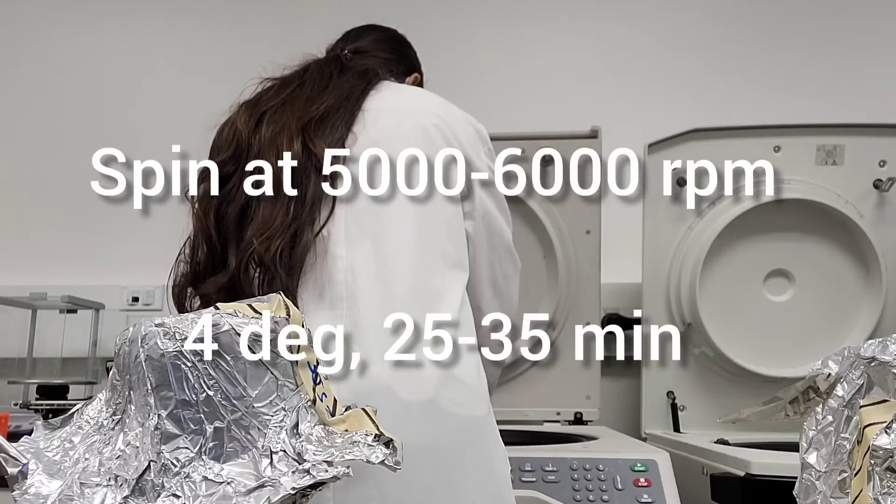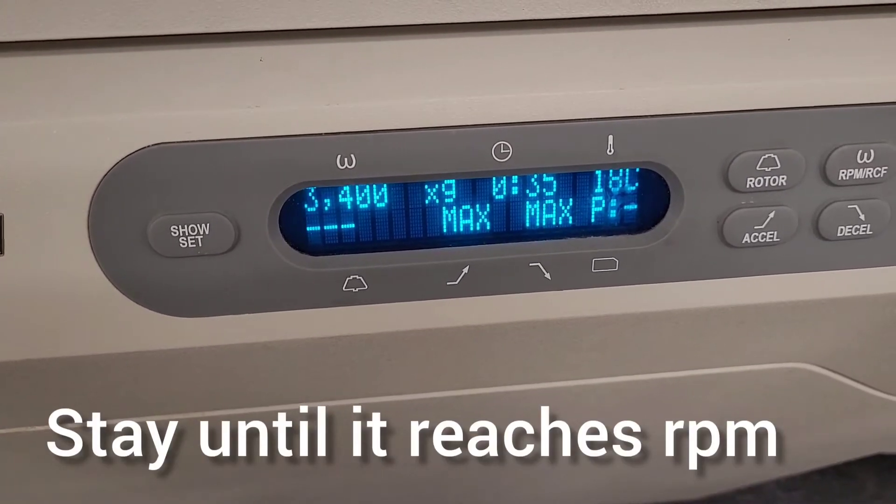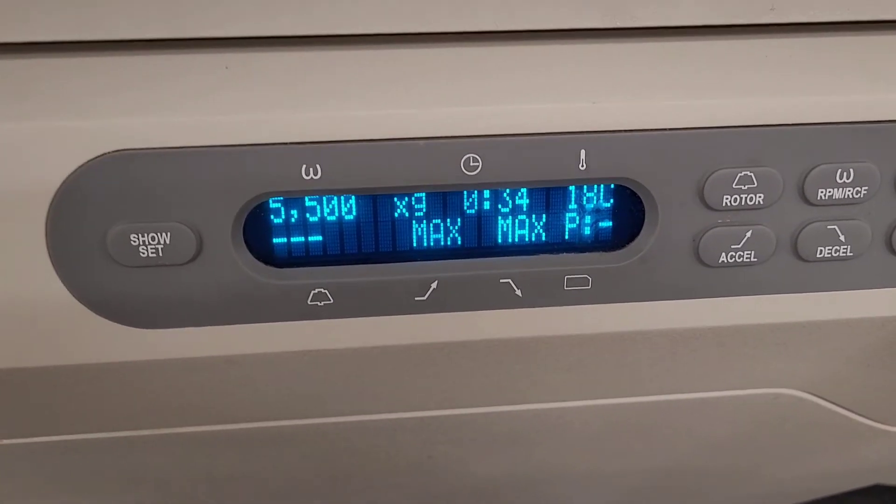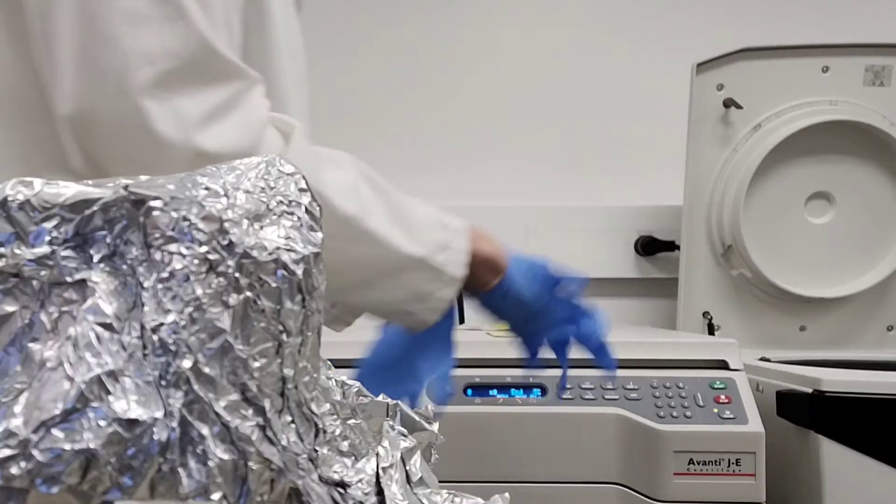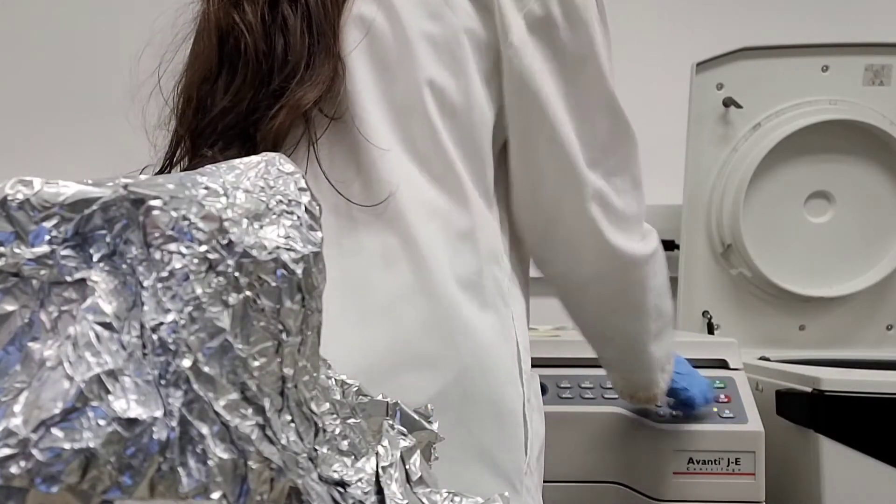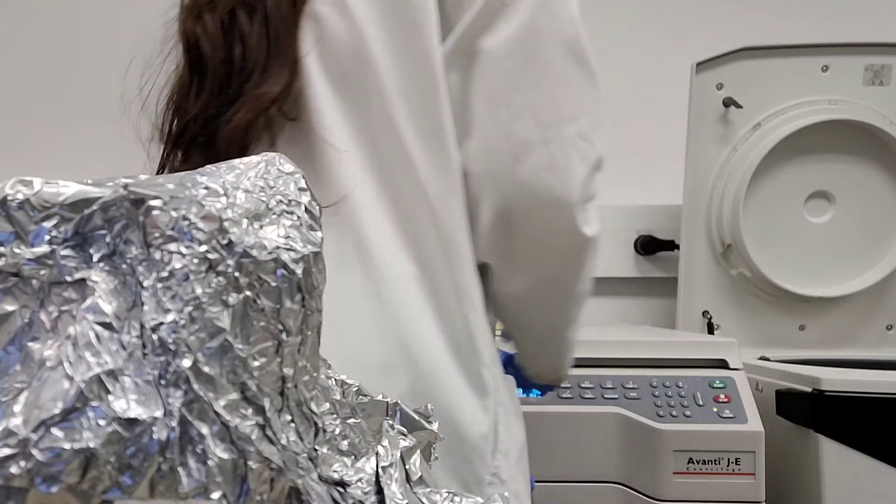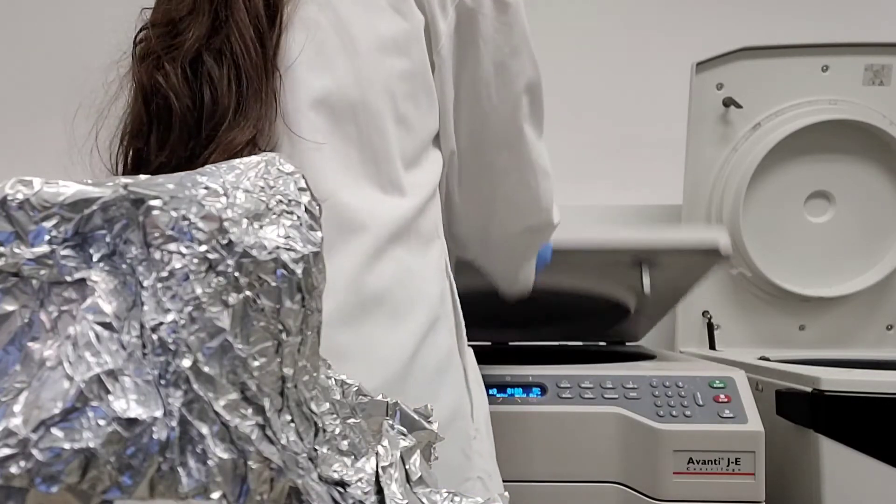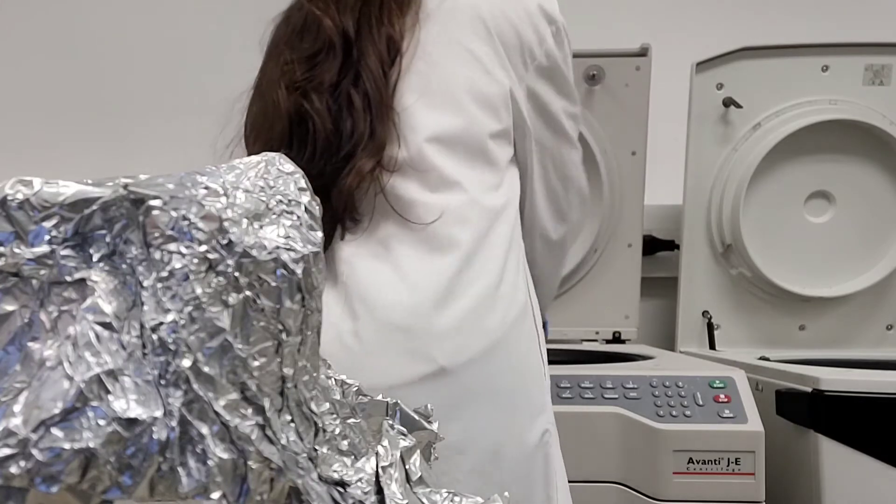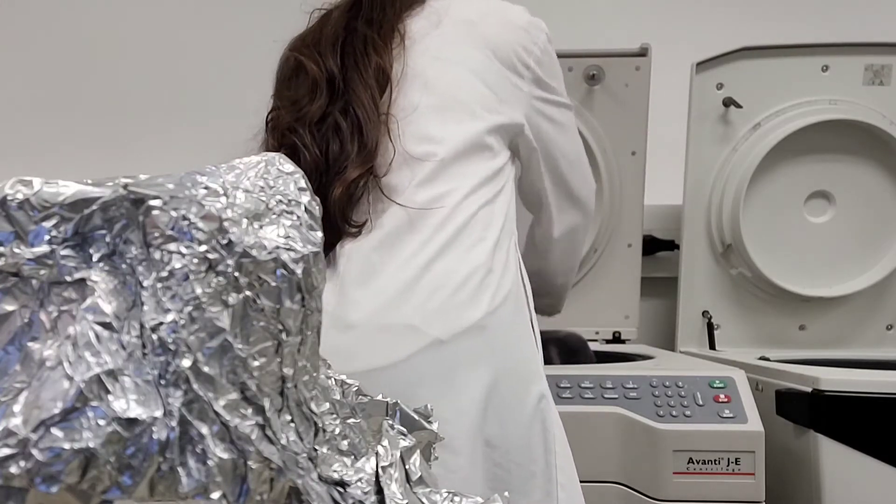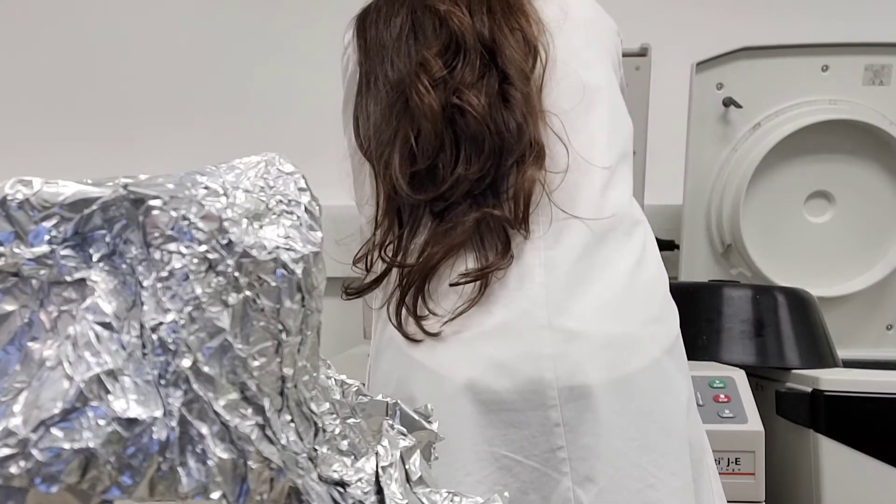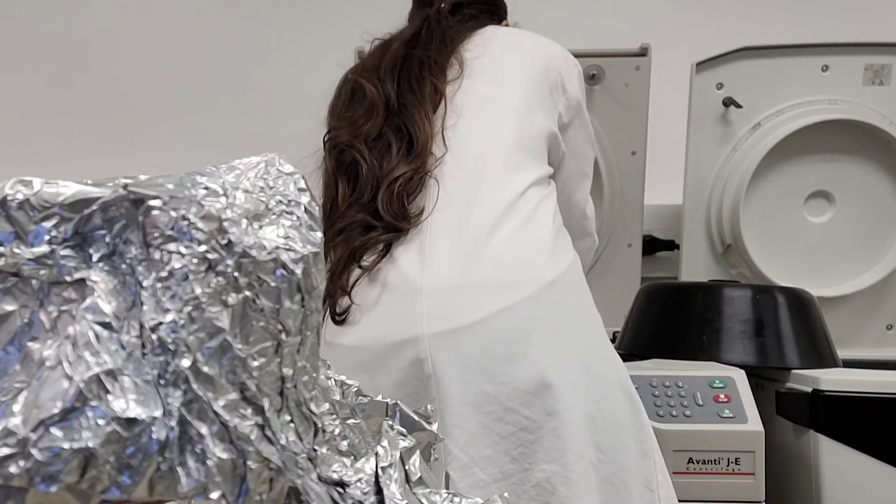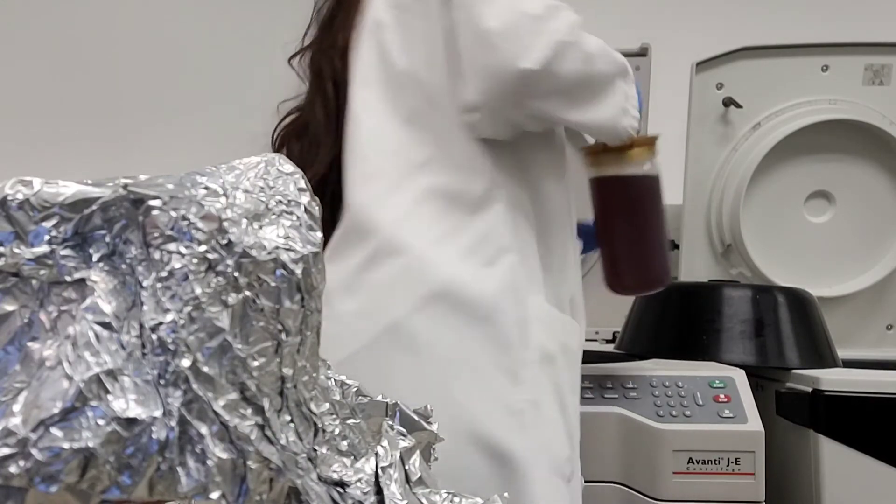Then spin it for 5500 rpm, about 35 minutes at 4 degrees. You want to stand there until the rpm reaches the selected 5000 something or 6000, whatever you select. Just make sure it reaches that and then you can walk away. After 35 minutes it's finished, you take them out.